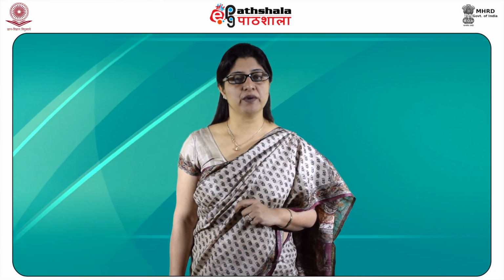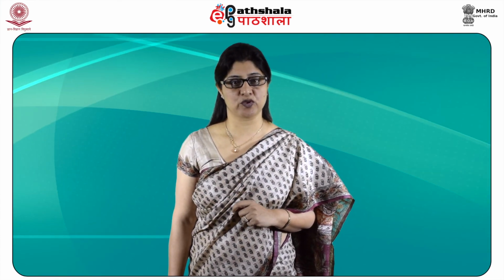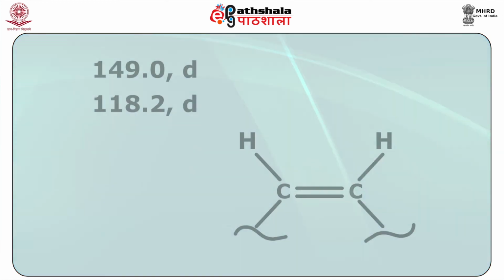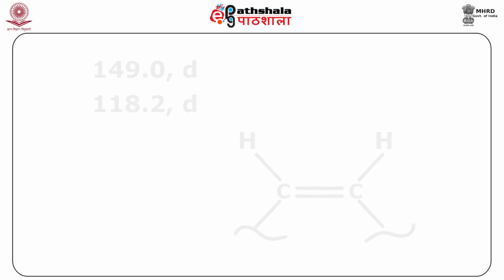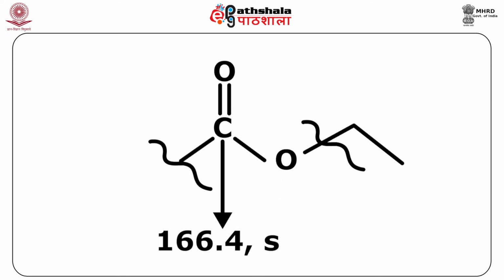The double bond equivalence for the given compound is found to be 2. The substructure associated with the 13C NMR is a disubstituted alkene. It accounts for 1 double bond. So, the structure can be assumed to be CH double bond CH further linked to other substituents. The substructure associated with the 13C NMR is also a carbonyl group. This accounts for the second double bond.